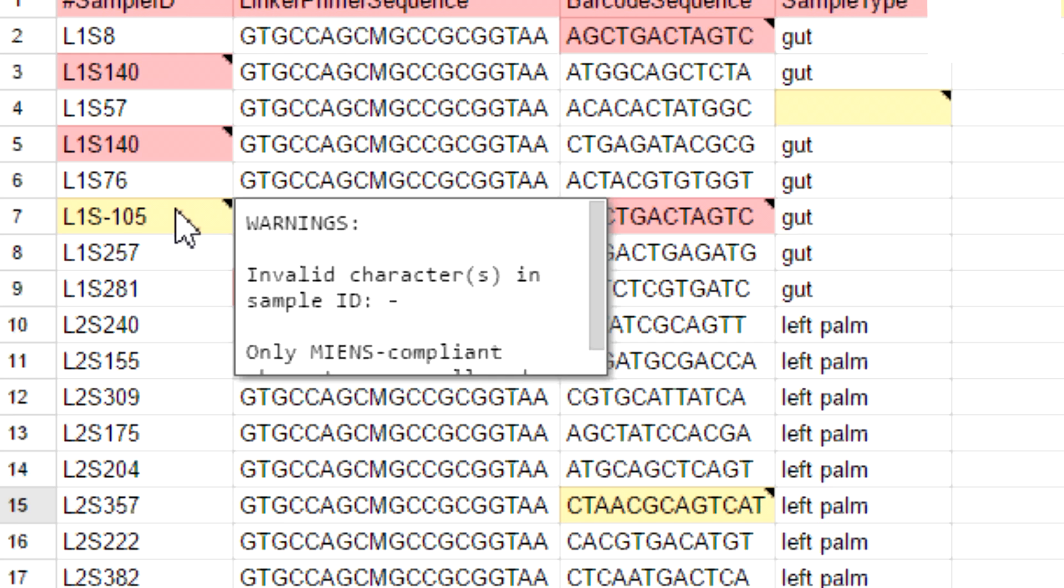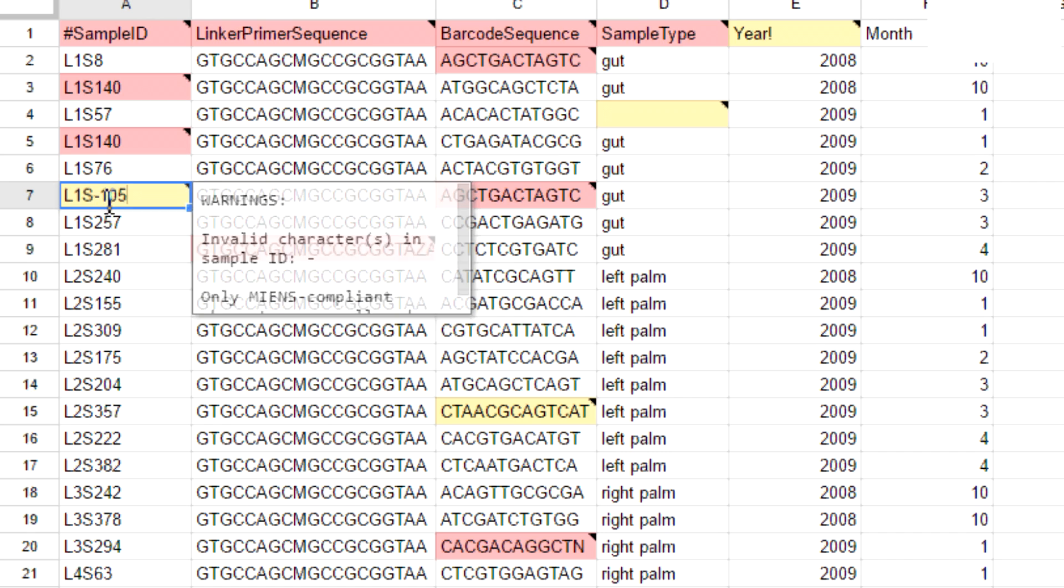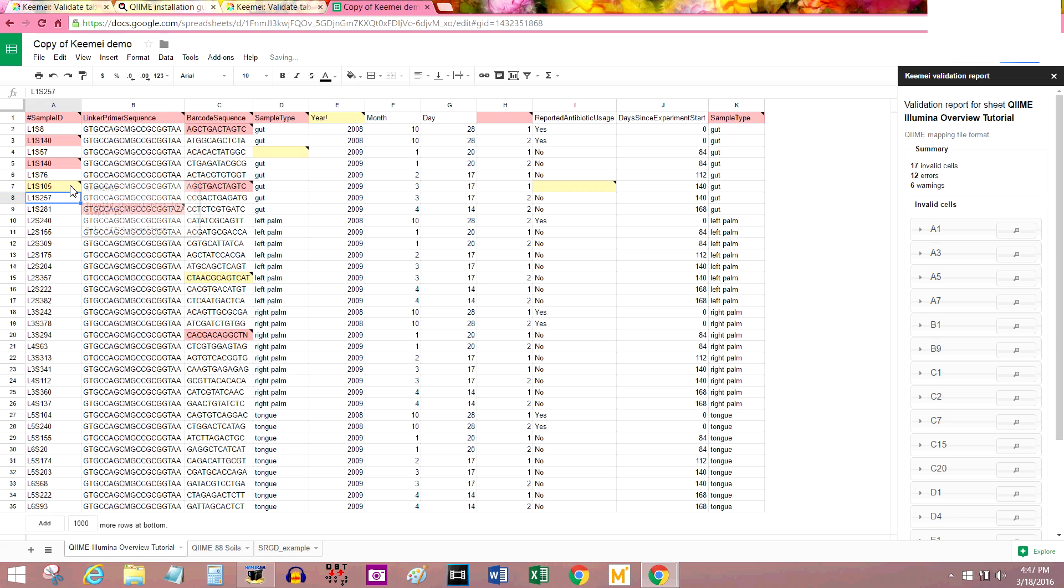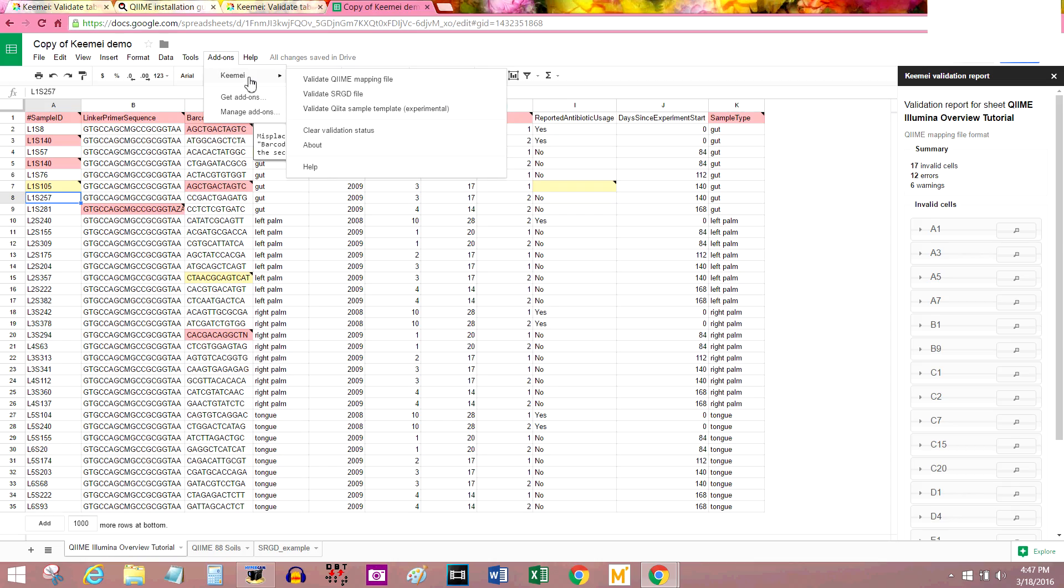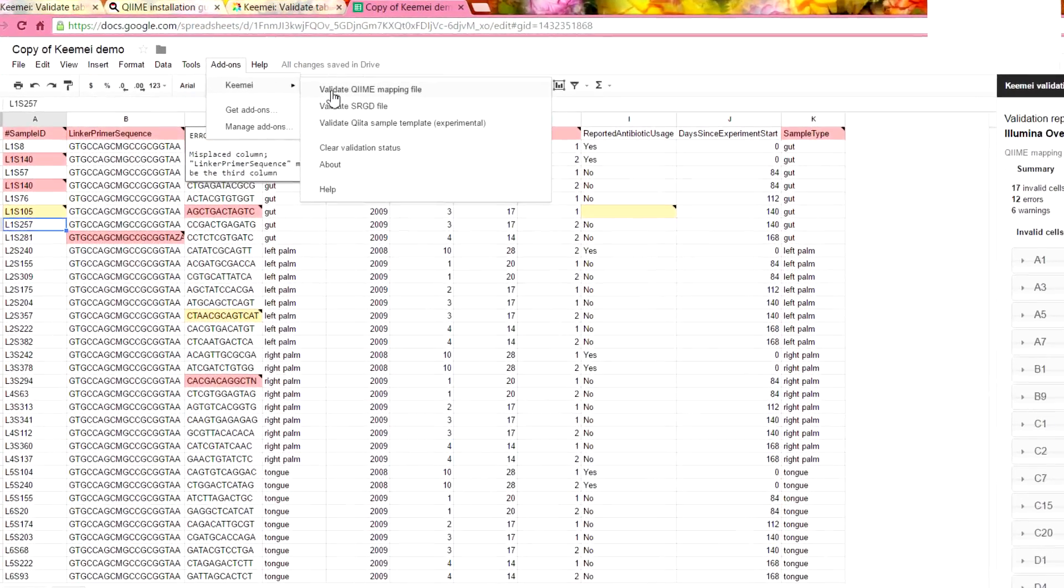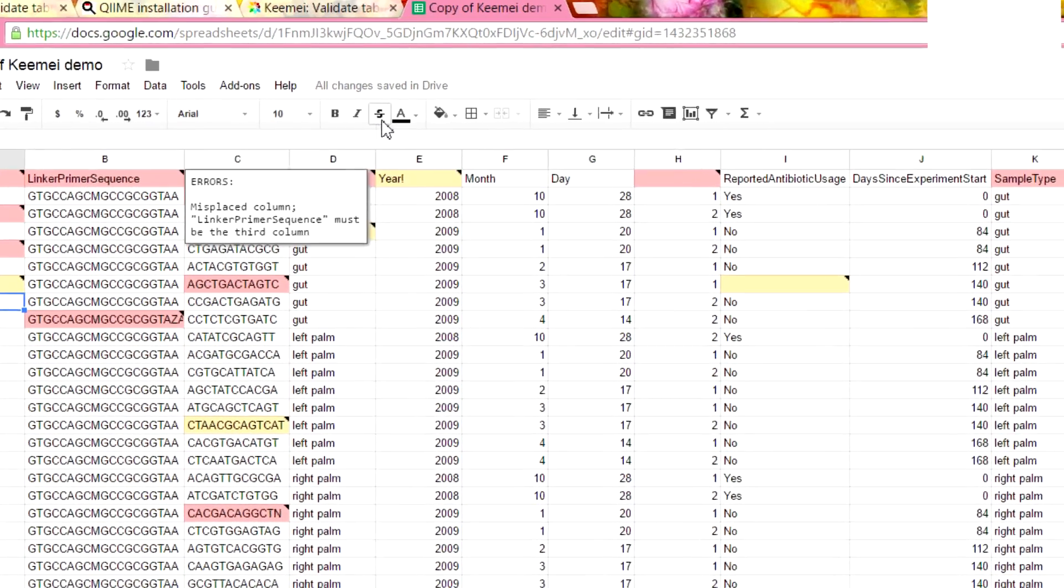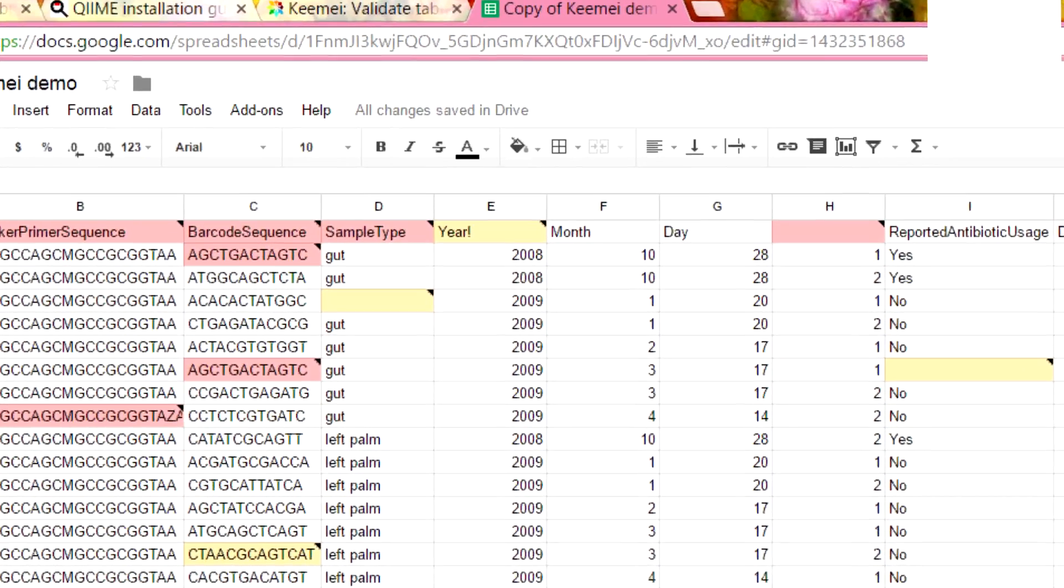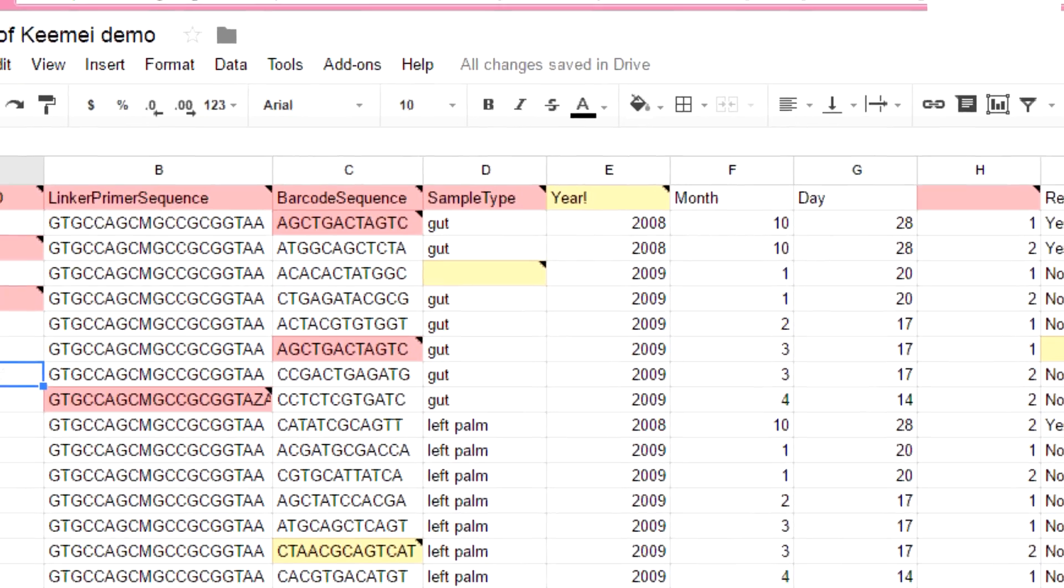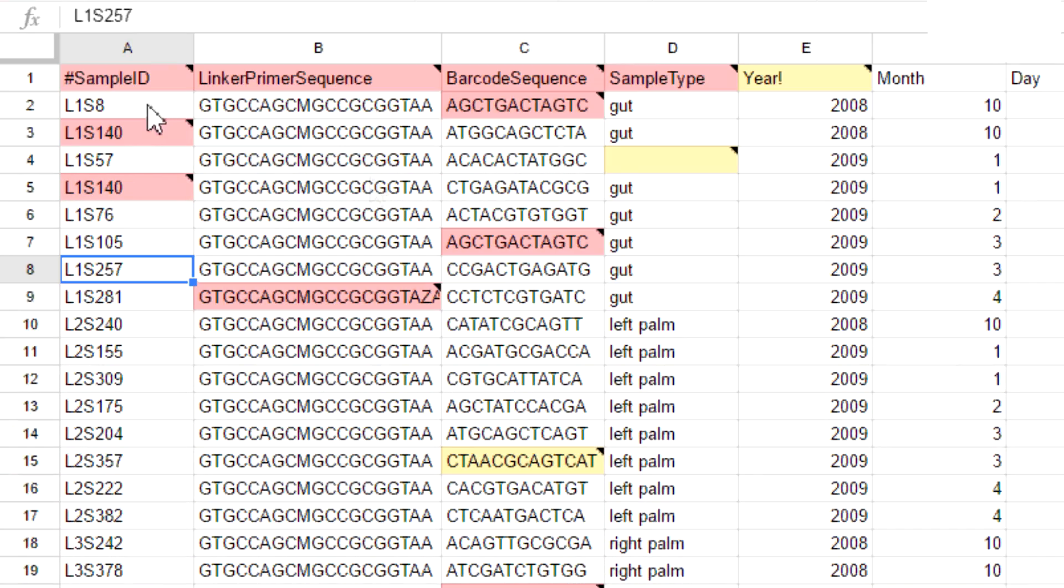Here in A7, it's saying that there's an invalid character. I'm not going to show you how to fix all of these errors, but this one's pretty easy. I'm going to get rid of this dash here. Now if I wanted that box to go away, I would run Keemel again. Just by pressing this validate QIIME mapping file again. It's working. And look at that. A7 is just fine.